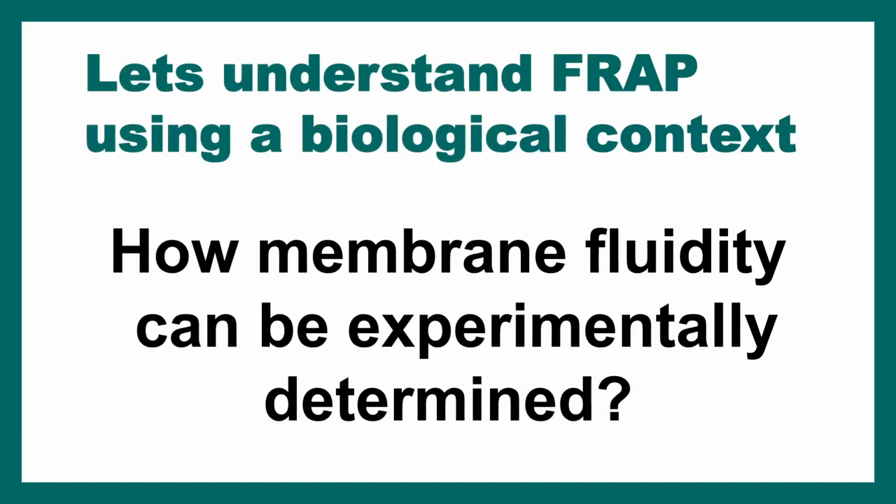So let's understand the principle of FRAP using a biological context. The biological context is how membrane fluidity can be experimentally determined. We are thinking of an experiment where we have to determine the membrane fluidity, and in order to ask this question, we can utilize the technique called FRAP.